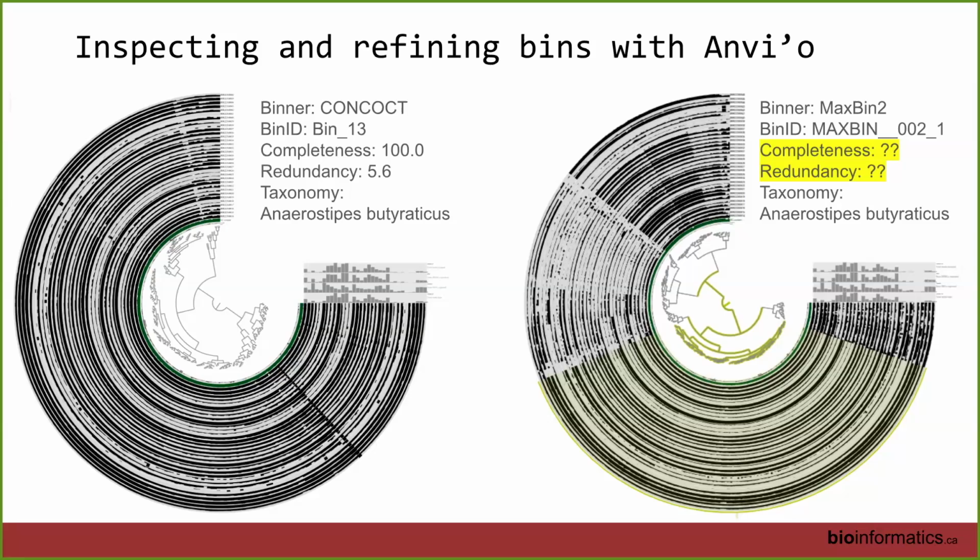The exact same assembly. Each of these profiles are a set of all of these are samples from the same study. Two different algorithms, clustering it two different ways. That's right. And notably all the other parameters are the same, other than the binner. And if you added another binner, you get another. And if you added another binner, you get another, so on and so forth.